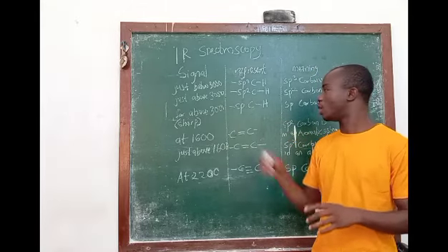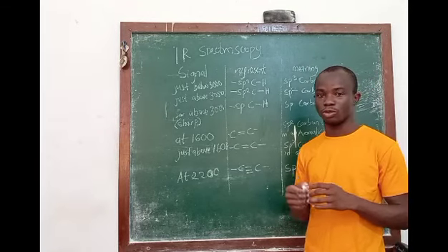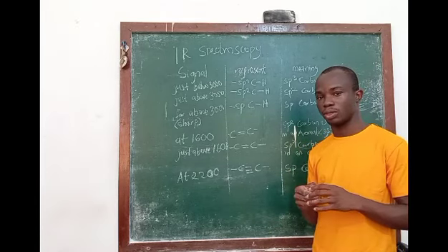In the next lesson, I will try to give you more about other things you can also look out for to be able to know what class of compounds you are having in an IR spectrum.